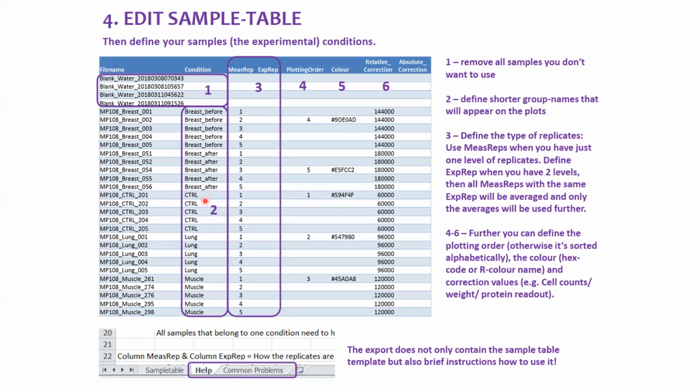You can see the condition of the analysis which you carried out. It tells you the number of replicates, and each replicate may have an extension as well. It tells you the plotting order, how you want it to be plotted. It also gives you the privilege to choose the colors, the graph, and other appearance of the table, playing with colors here and there.